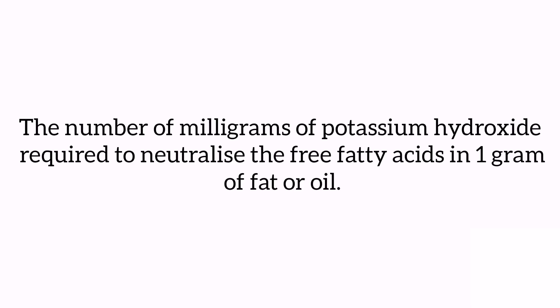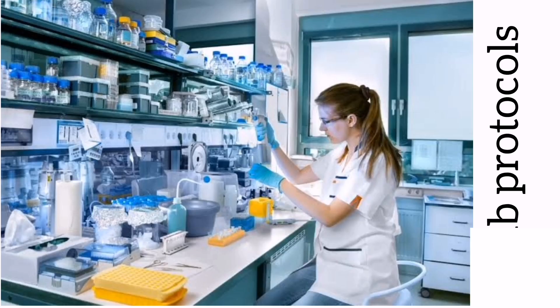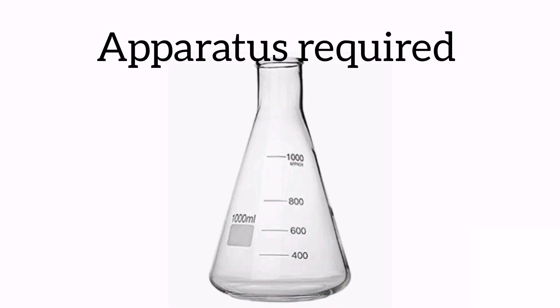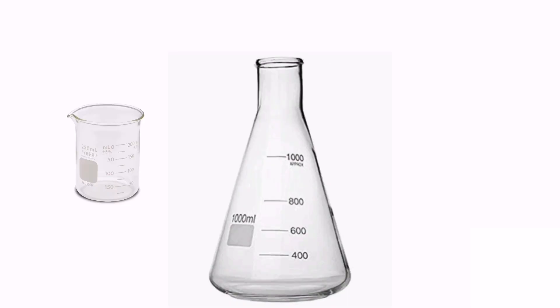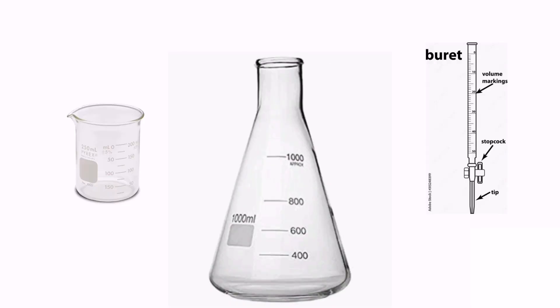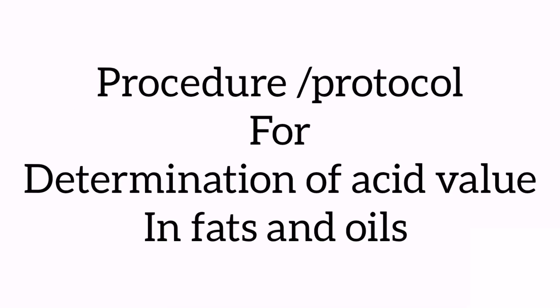Acid value is the number of milligrams of potassium hydroxide required to neutralize the free fatty acids in one gram of fat or oil. Now let's start the experiment. Apparatus required: conical flask, beaker, burette, and measuring cylinder.